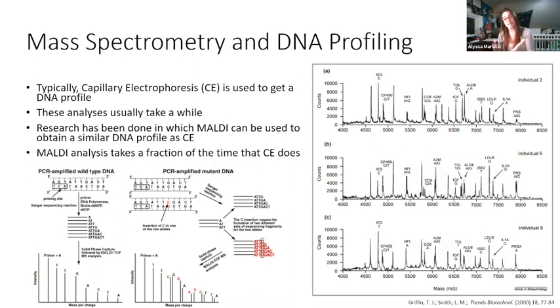So rather than the analyst saying these two hair samples are not consistent or we can't tell the difference, you move to hair protein analysis or amino acid analysis, and you could say, well, actually they are different. So they're not from the same source.